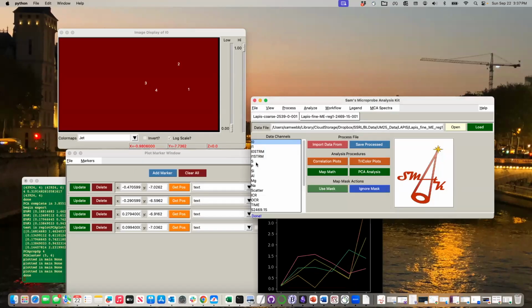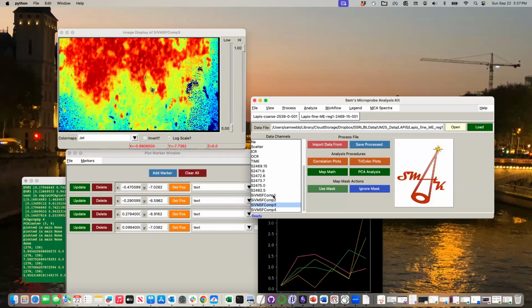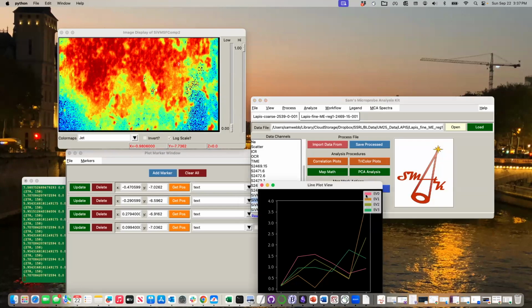So here's our sulfur map. There we go. Maybe slightly more relevant, maybe. Put it 1, 2, 3, 4. Yeah, actually, it looks pretty much the same, but it's good to know that it's not completely different. It just shows that you have a different extent of the species going out here between 2 and 3, and that is really the difference between the blue and the greenish pale one and the brown. So that's this monosulfide versus the all the way through the middle. Okay, beautiful.